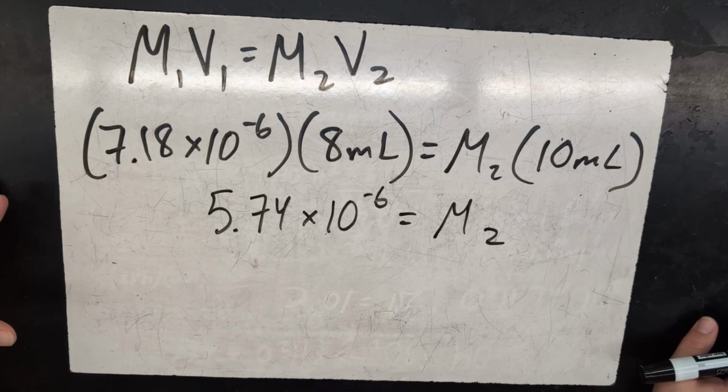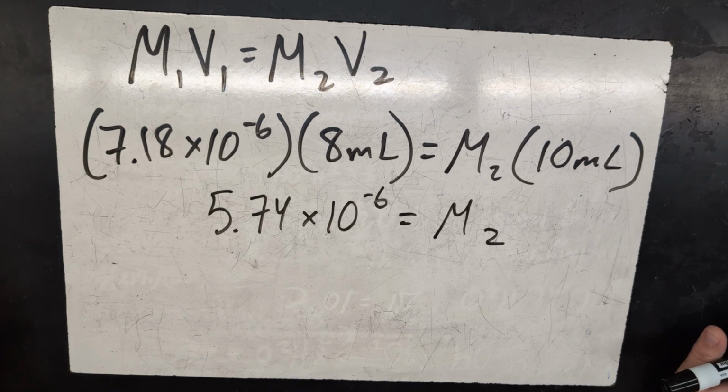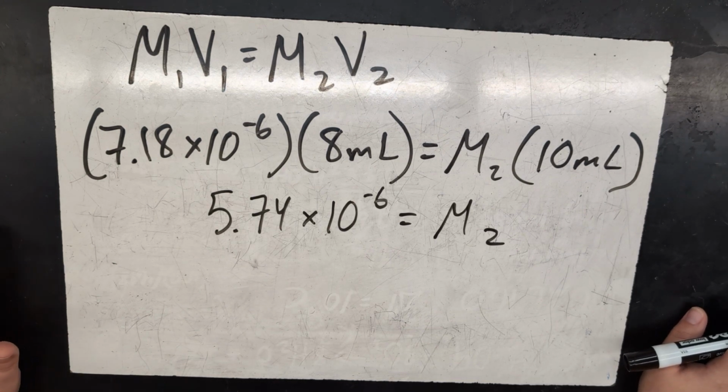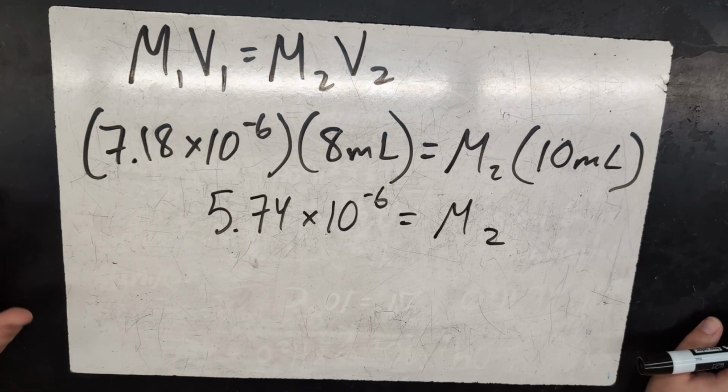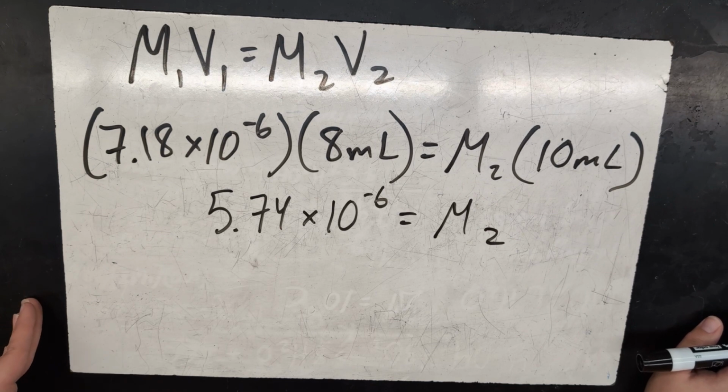You could even have one group do each concentration, and then in the next lab they can test that using the spectrophotometer, making their calibration curve. So feel free to use lab prep as a lab skill that is a teachable moment, basically.